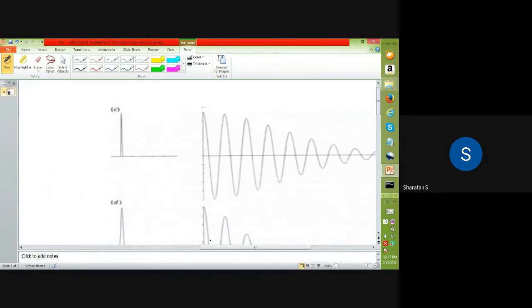If you are using a single beam, you can see here that you will get a pattern like this. It will always start from a cos wave, that is maxima, then go to a minimum, and then again a maximum. You can see that the intensity is getting reduced. This kind of interference pattern we can observe because of that movement.